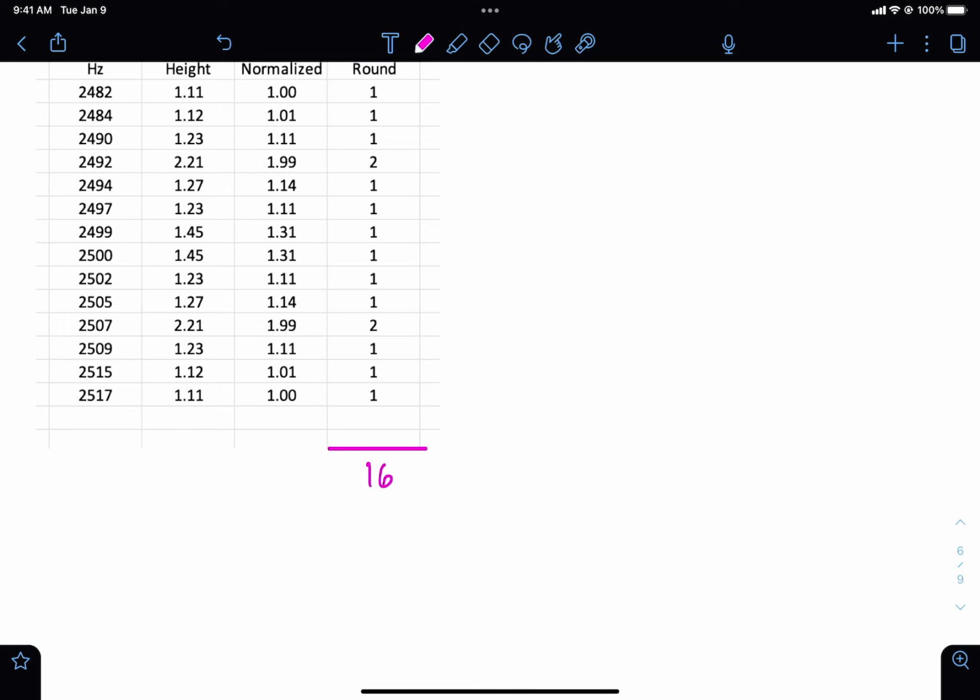So that means that 2 to the n is 16, and therefore n is 4. So we actually have the same choices that we had in our last problem. We could have a doublet of doublets of doublets of doublets. That's 4 interactions. We could have some combination of doublet, triplet, doublet. So doublet of triplets of doublets, or doublet of doublets of triplets, or triplet of doublets of doublets. Those would all be 4.